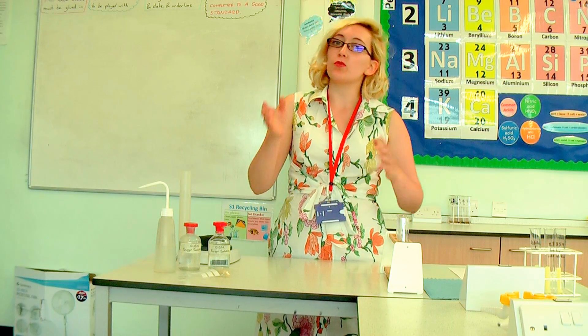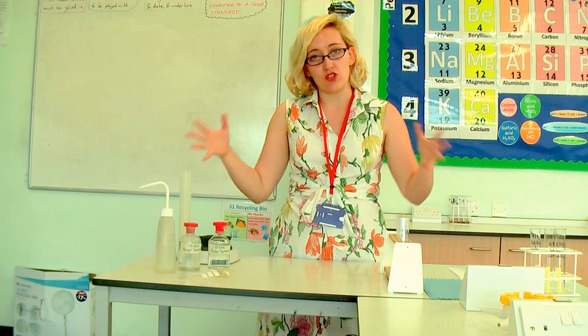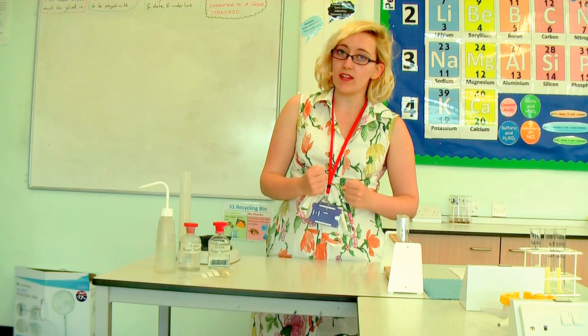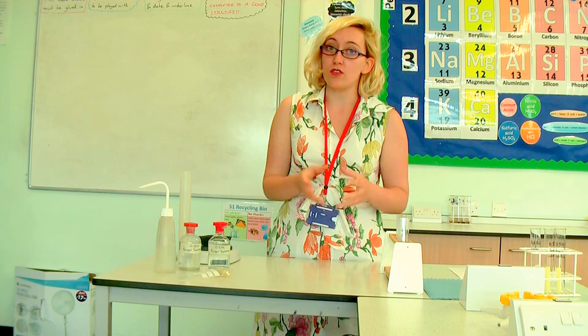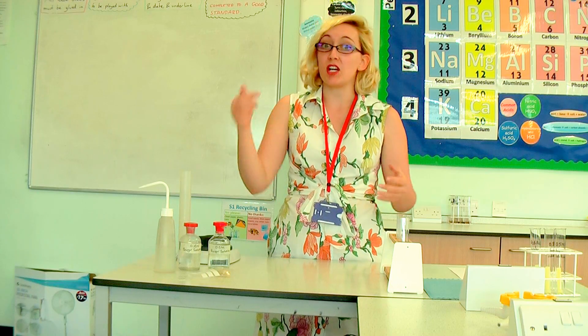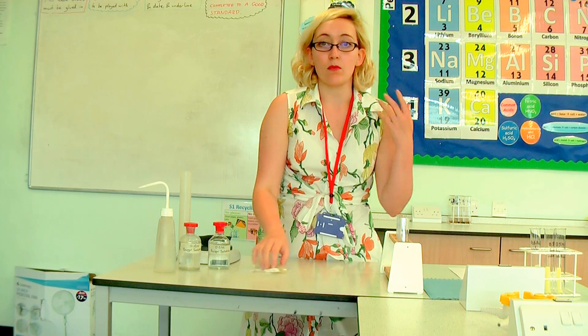So the potato should get bigger. If however we put the potato in a solution which has got more concentrated sugar — in effect the potato's got more water than the solution — then the water moves from the potato outwards, so the potato should get smaller. It's this effect that we're going to be investigating today.